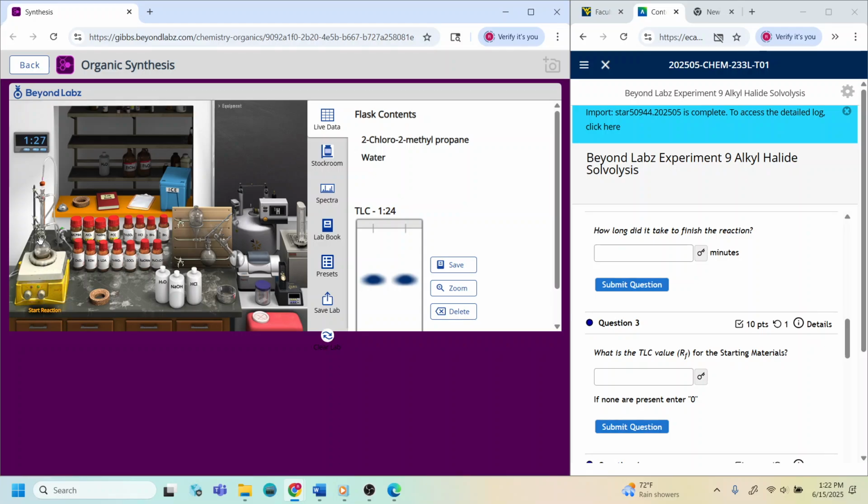Before we start the reaction, we have a clock in here, and the clock moves by hours and minutes. This is every 10 minutes, and this is every 1 minute. So we can simply speed up the reaction by 1 minute, 10 minutes, or an hour. Never do the hour, except if the experiment is very, very long. We're going to start first with the minutes, okay? We can do either 1 minute or 10 minutes in there.